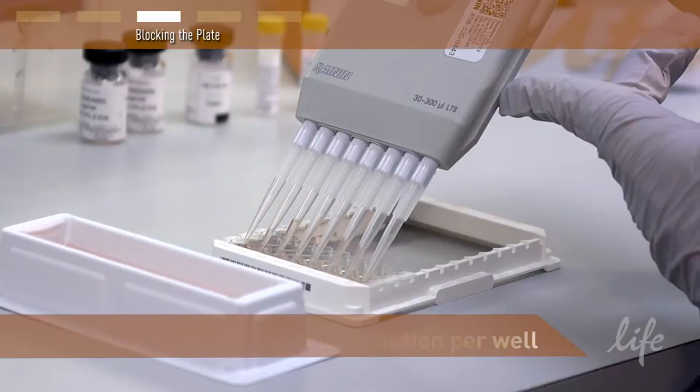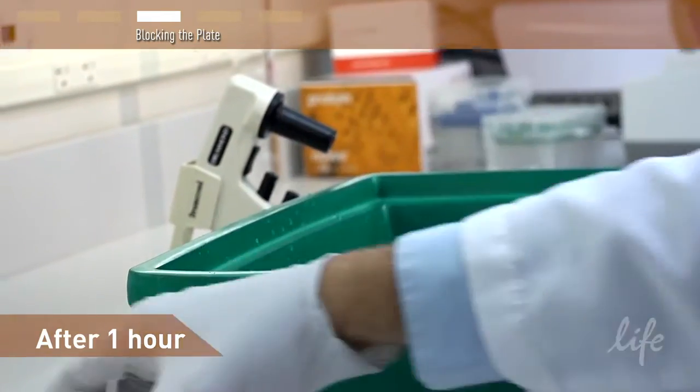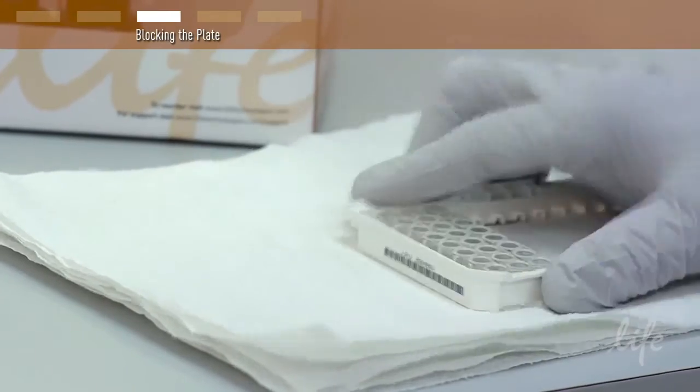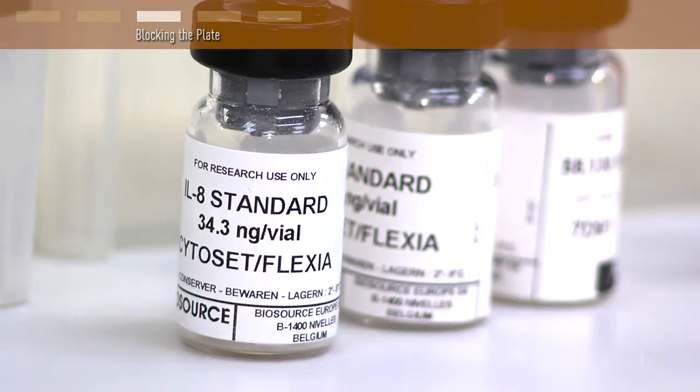After one hour, decant or aspirate the liquid from the plate and remove excess liquid by blotting against absorbent paper. Be careful not to scrape the bottom of the plate with the aspiration needles from the automated plate washer. With the plate ready, we can proceed with standard curve and sample preparation.